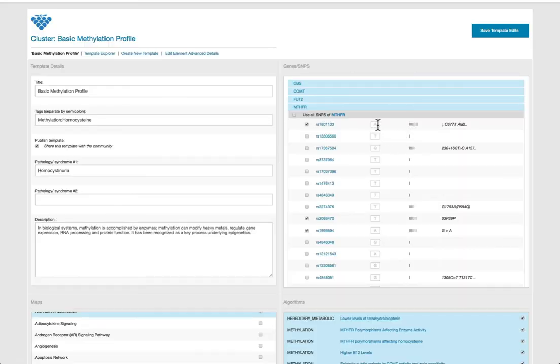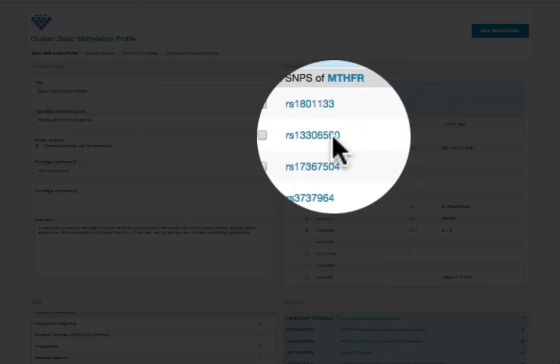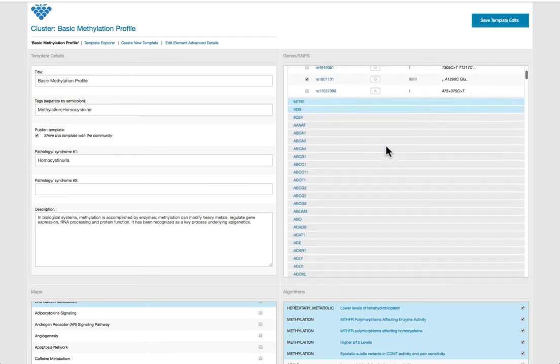The reason that this is here is that there may be, in your world, a reason to identify the opposing allele as the actionable allele. So for instance, let's say that Opus considers A the risk allele in its calculations, but you have some new study that shows that the other allele is associated with something beneficial or something completely different. Well, you can change the allele here to the allele that you want, and when Opus does its calculations as to the genotype, when it draws the various colored boxes, it will use the allele that you gave it. If you don't put anything here, the template editor will simply use the default Opus risk allele, and away you go.